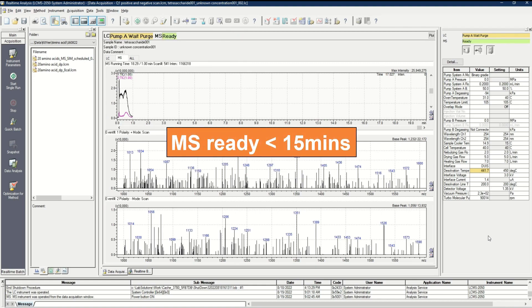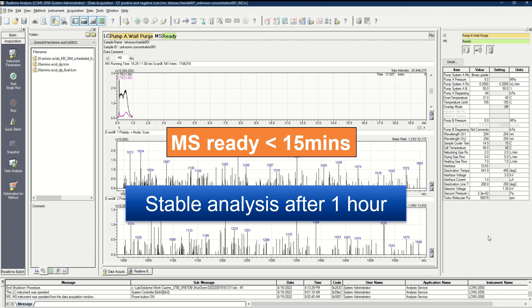With desolvation temperature on, the MS shows ready within 15 minutes. I wait for an hour before proceeding to sample analysis to make sure a stable result is obtained. This is the end of my video. I hope you found it useful and start maintaining your LC-MS 2050. Thank you.